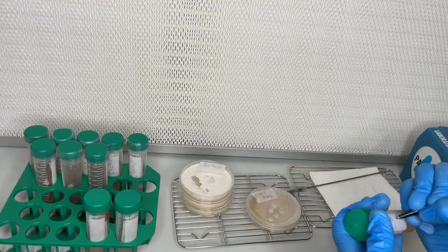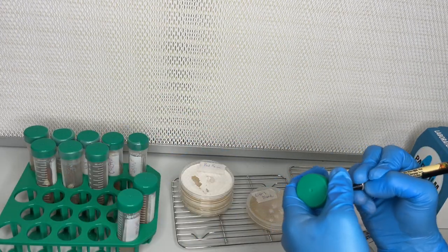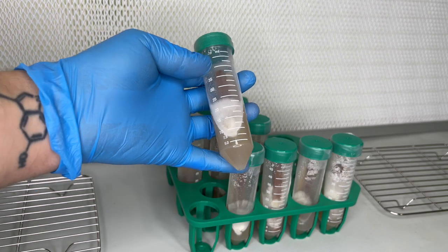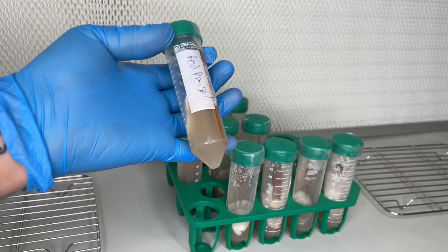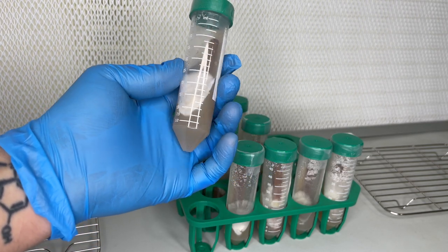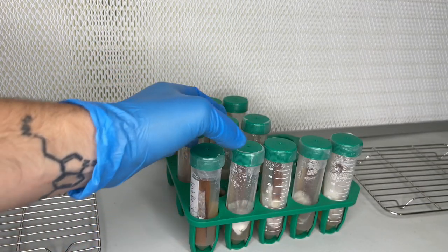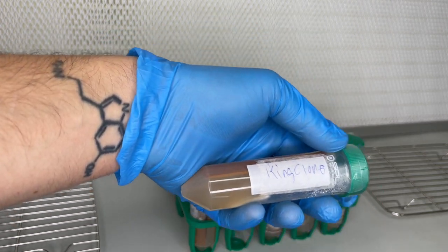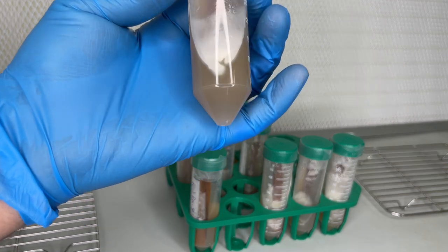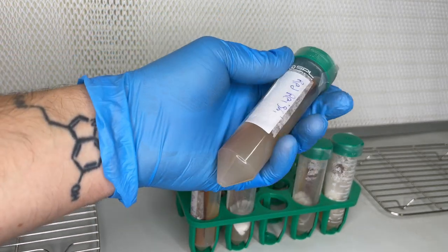Culture slants are labeled and allowed to colonize at 78 degrees Fahrenheit. After 1 week of colonizing, you should start to see a nice patch of mycelium. After the culture slants are fully colonized, they will be placed inside of the refrigerator. The cold temperature will cause the mycelium to slow down and maintain its viability for potentially many years. Every 12 months, they should be removed from cold storage and transfers should be taken to create new culture slants.